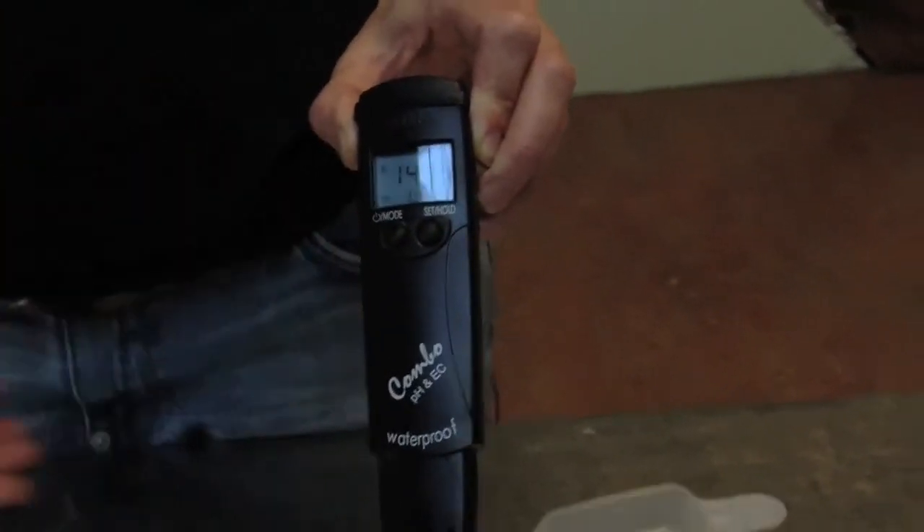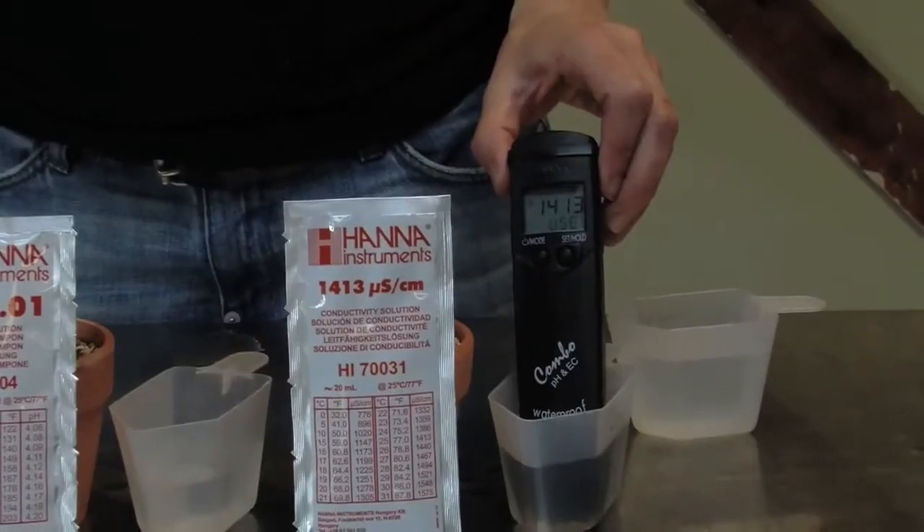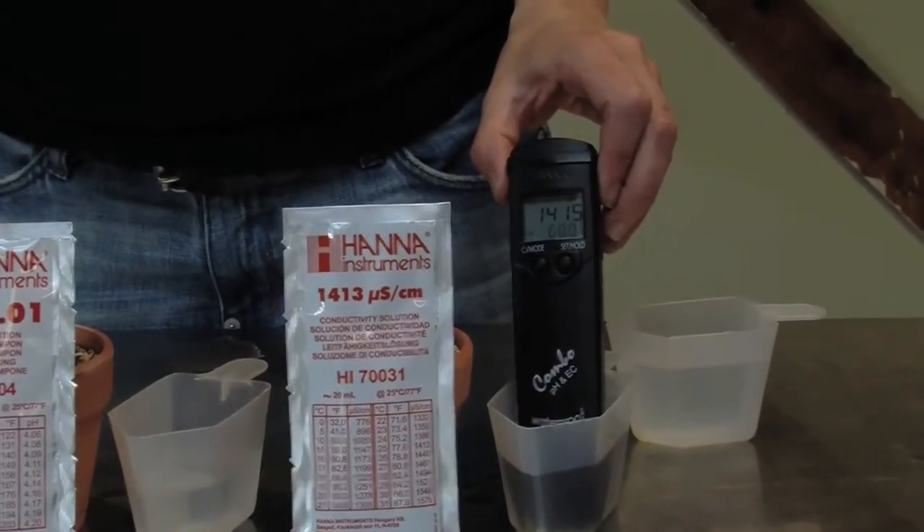Place the pen in the 1413 solution. Wait a few seconds up to a minute, and then it will say OK. The pen is now calibrated.